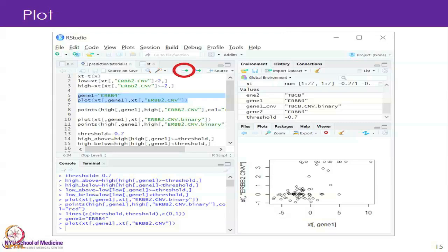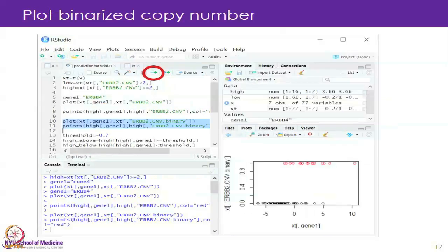Now we plotted copy number here, but we are really only interested in whether the copy number is low or high. We have another column — ERBB2.CNV.Binary — so now we are going to plot that. It is the same plot but we are changing from the actual copy number to either 0 if the copy number is low, or 1 if it is high. After running this, the Y axis will be either 0 or 1, and all the red ones with high copy will be at 1 and the others at 0.